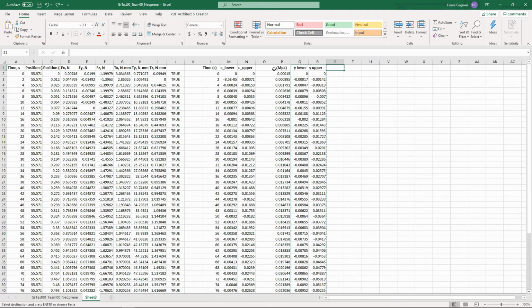Compute the shear strain for each layer by multiplying your set of shear deformation or epsilon value by a factor of 2 using Equation 2.